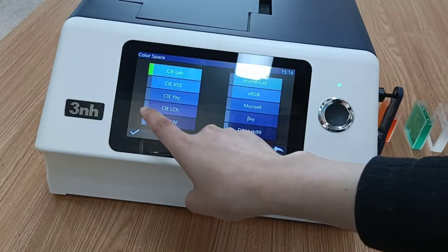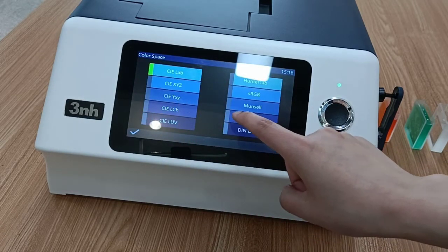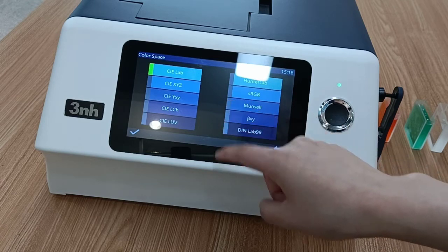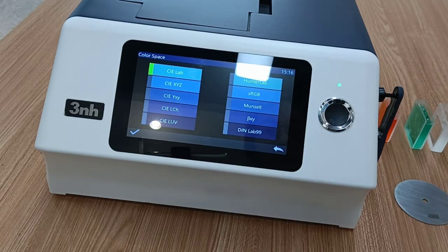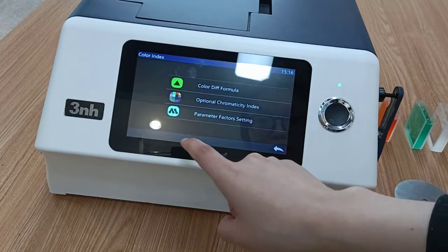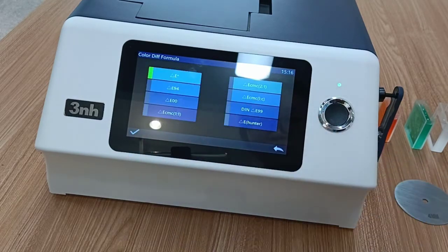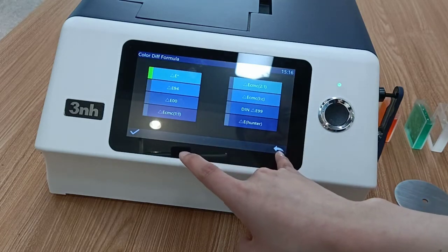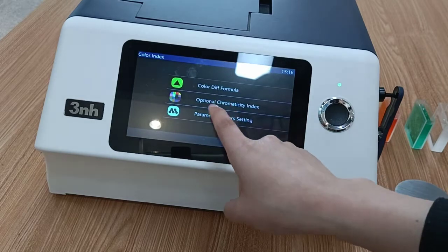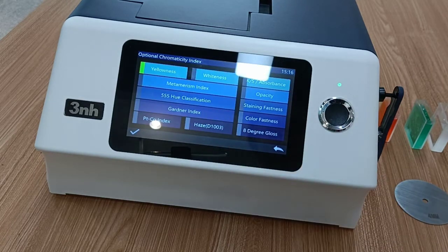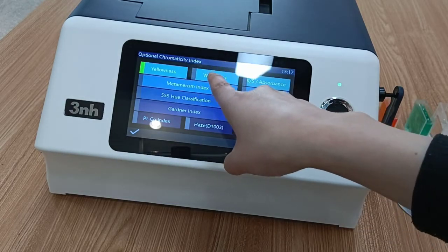The next one is color space. The first one is also the most frequently used color index. There are different color indices suitable for different industries, as well as some optional chromaticity indices. We can also select the whiteness option.